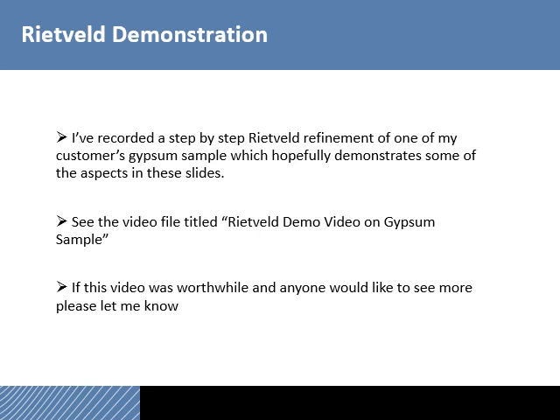So please make sure you download and watch the Rietveld demo, because it's part of this lecture. In terms of what I would expect you to be responsible for with the Rietveld, you certainly aren't expected to know the math behind it. I said a number of times, really the point of the class is for you to know the characterization techniques so that when somebody asks you to do something, you know what technique will get you there.